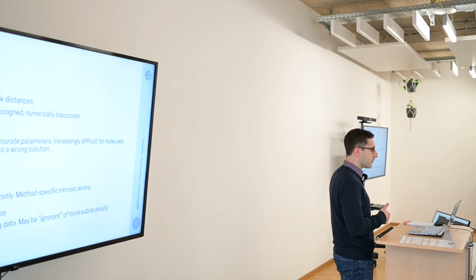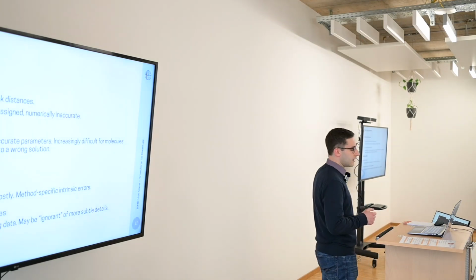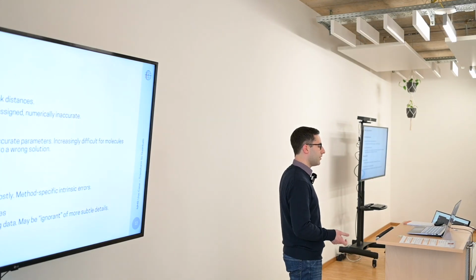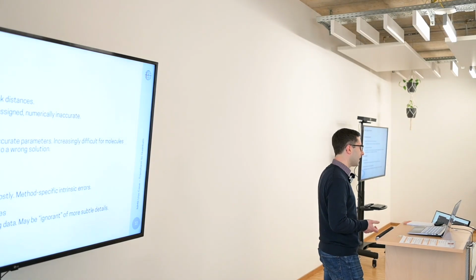But that of course requires you to be able to do the fitting procedure in the first place, and this works if you have a sample and you know precisely what is in the sample. A lot of the time you want to do structural validation, so you want to know, okay, do I actually have what I think is in the sample or not? In that case, you would probably want to predict the parameters.